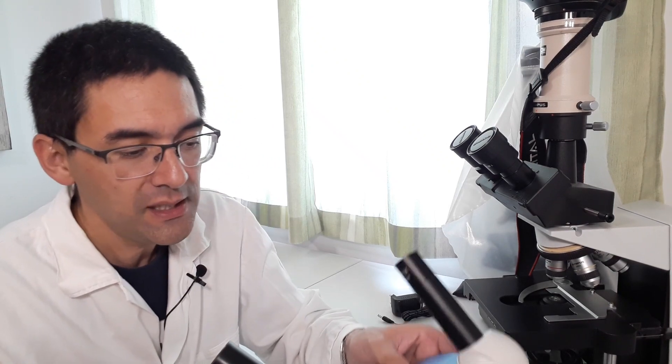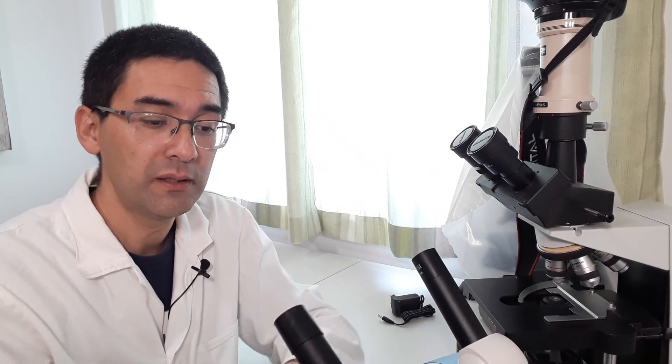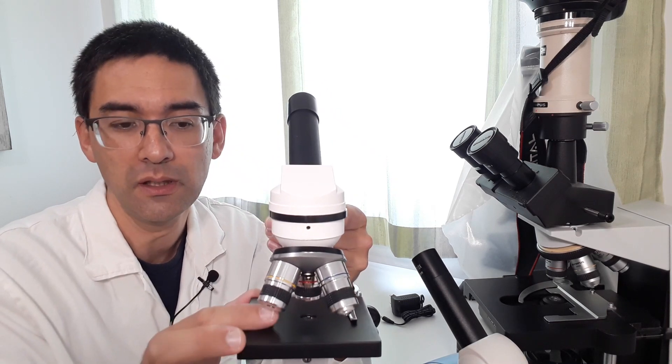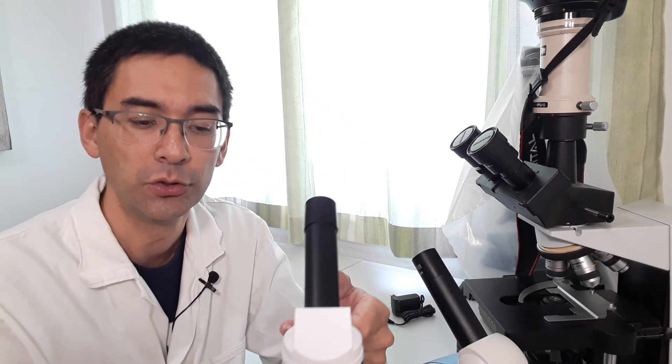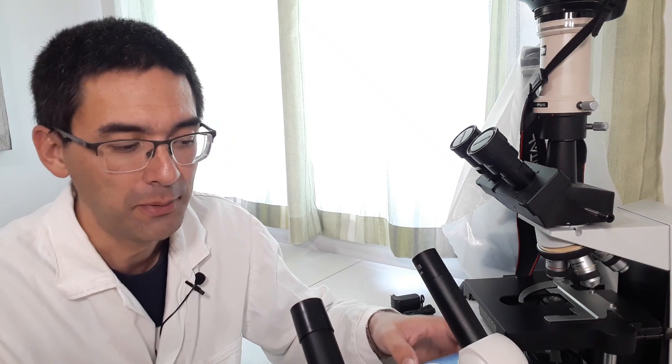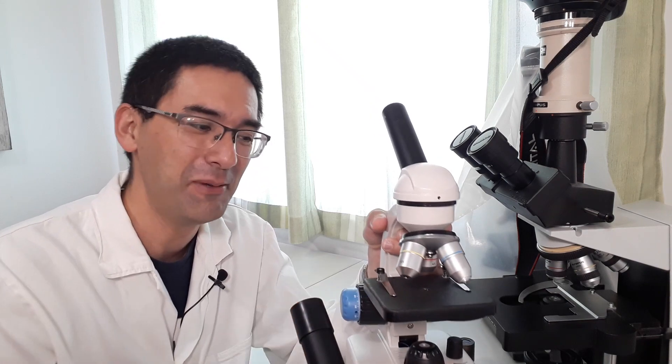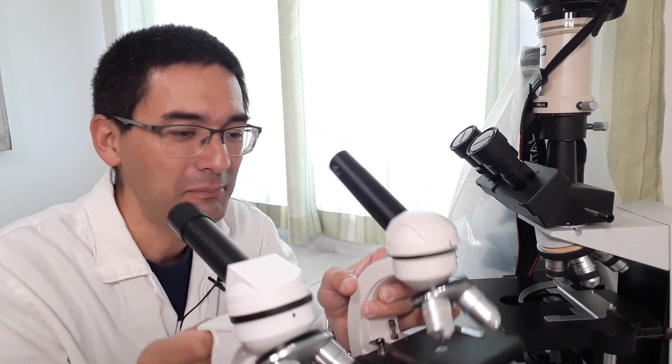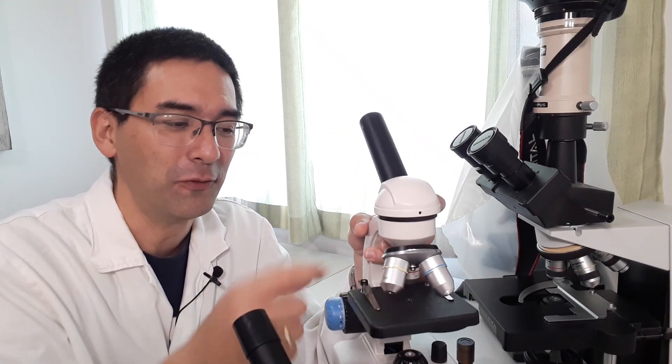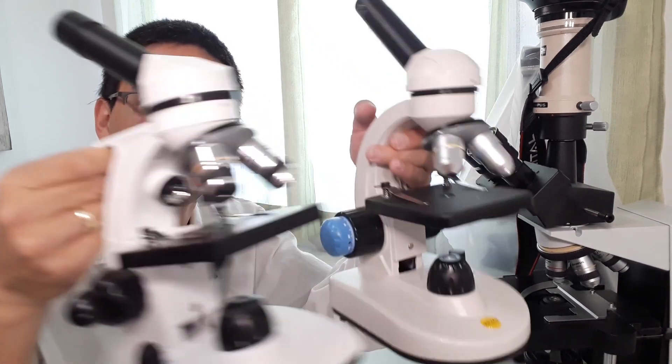One difference is here, the stage here is made of plastic. While this one here in the Telmu microscope is made actually of metal. I don't think that this has a significant difference. I think that's a non-critical part, I would say. But just to be mentioned, the ironic thing is that they're so similar. For me, it would be possible probably even to exchange the stages because I've actually measured it out and they look almost identical in that sense. Although the places where the holes are for mounting the stage, they seem to be identical. So there are many similarities here between these two microscopes.